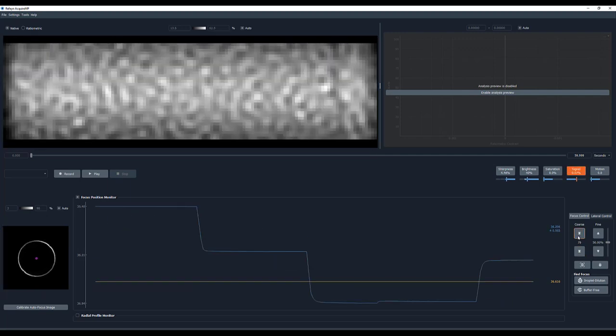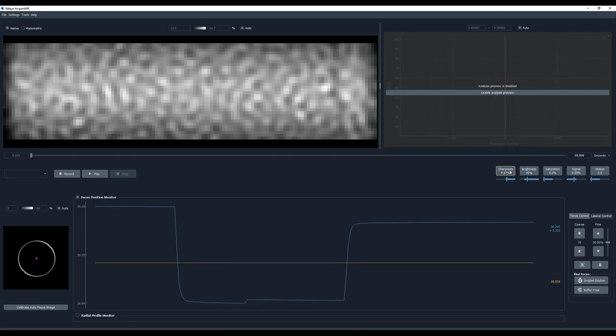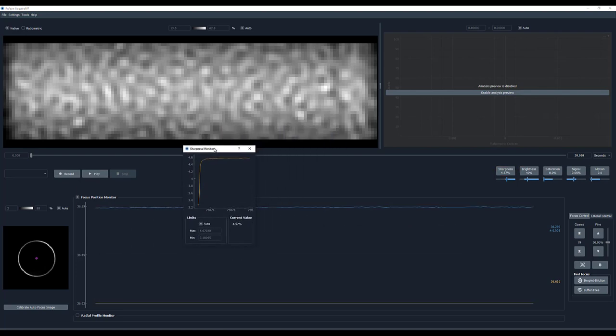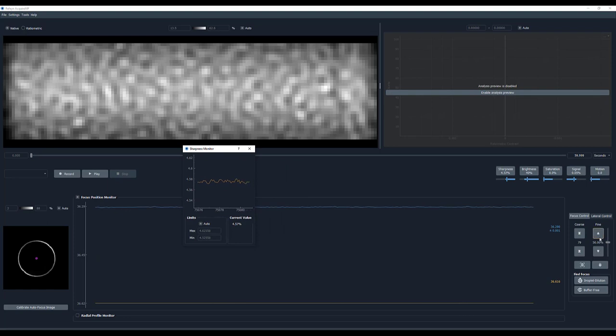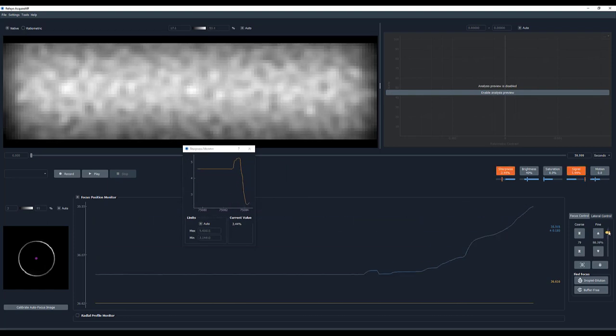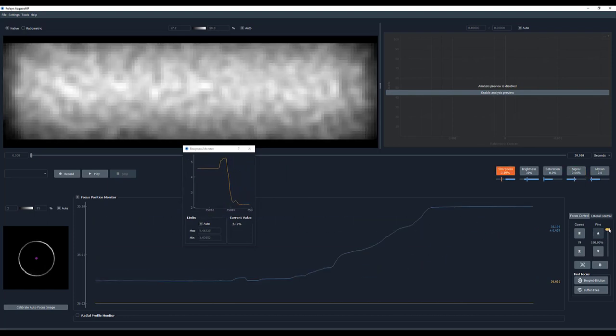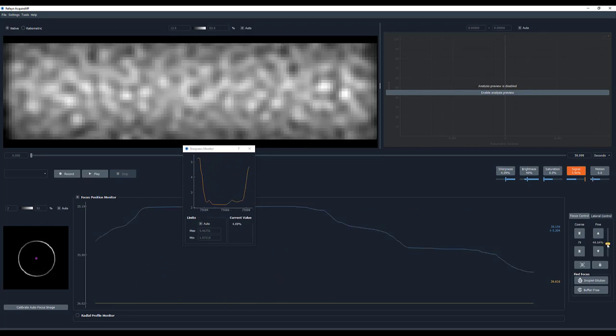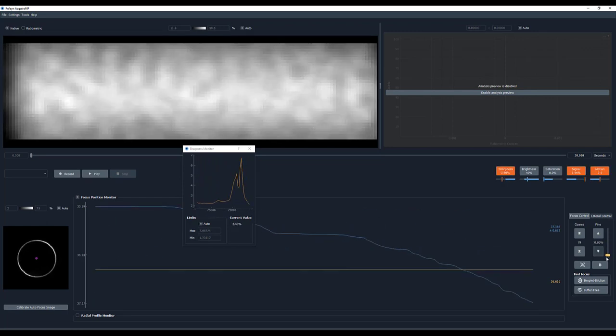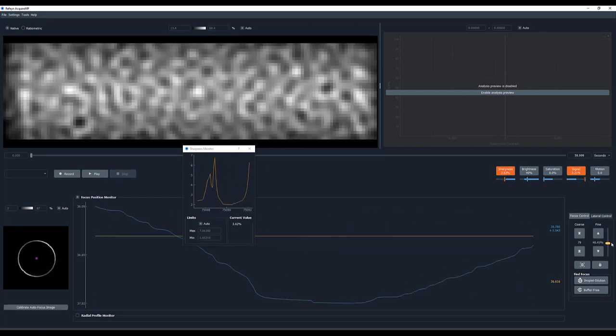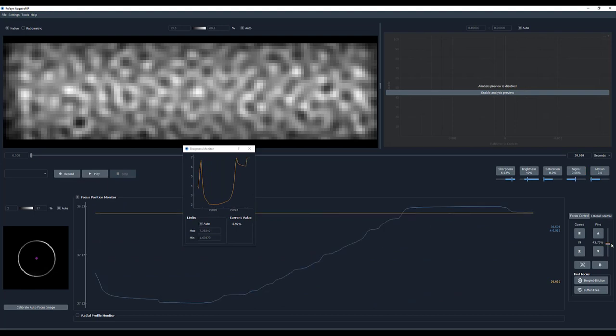Click the Sharpness button to open the Sharpness Monitor dialog box and use the Fine Movement slider and Steps to reach the maximum sharpness. Please note that there will be more than one sharpness peak, so it is advisable to scan a wider range to find the absolute maximum sharpness.